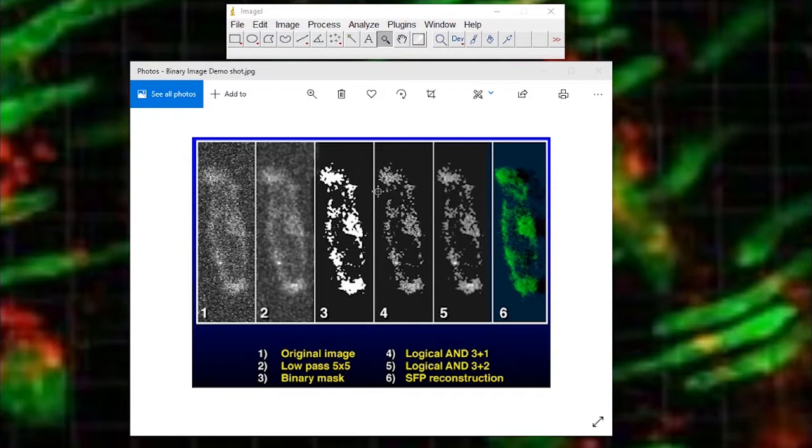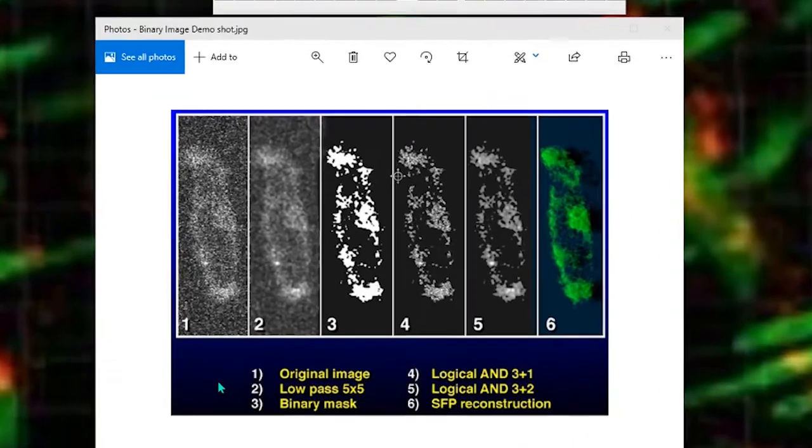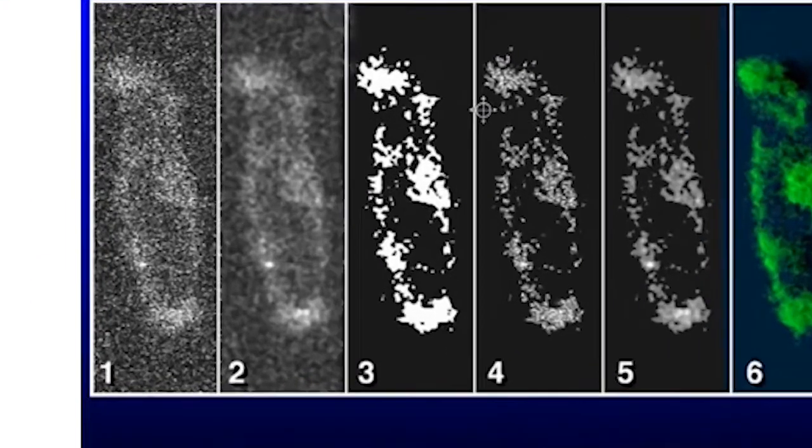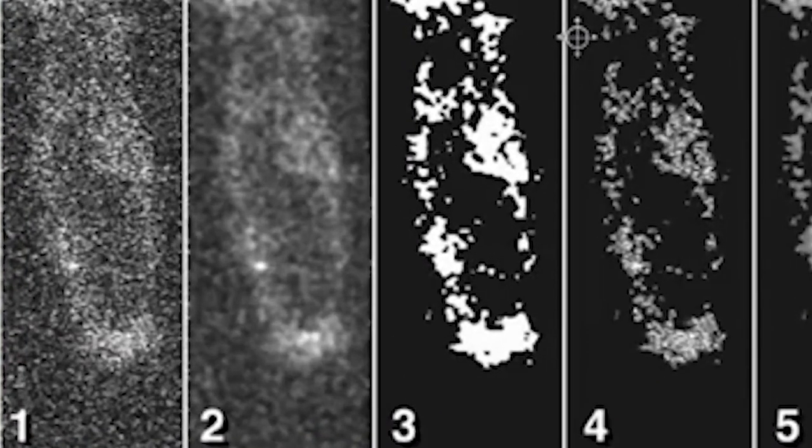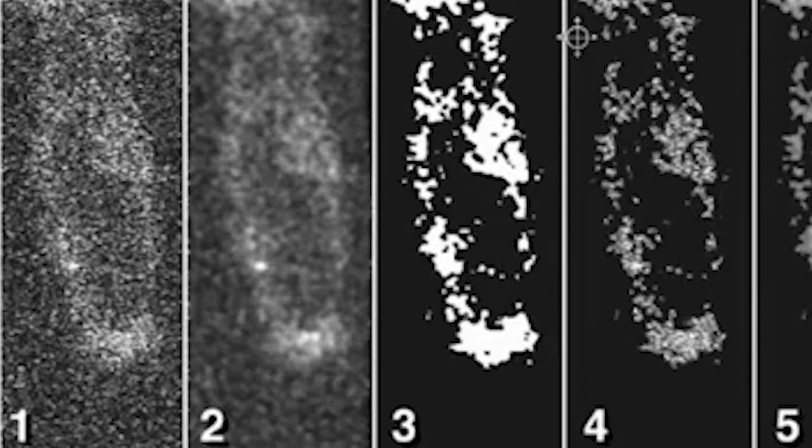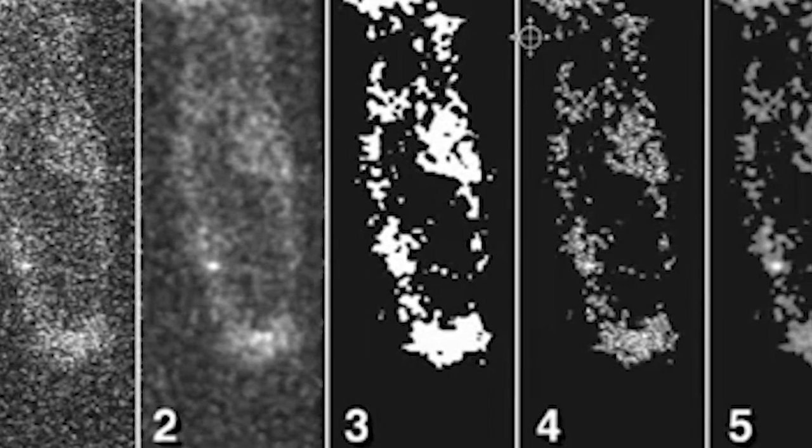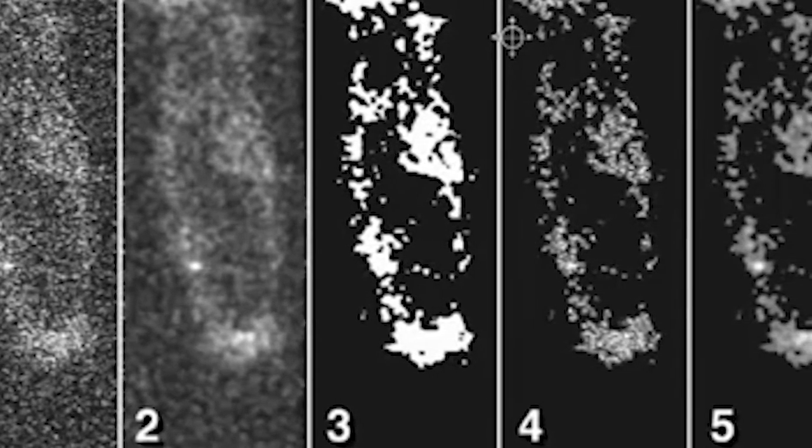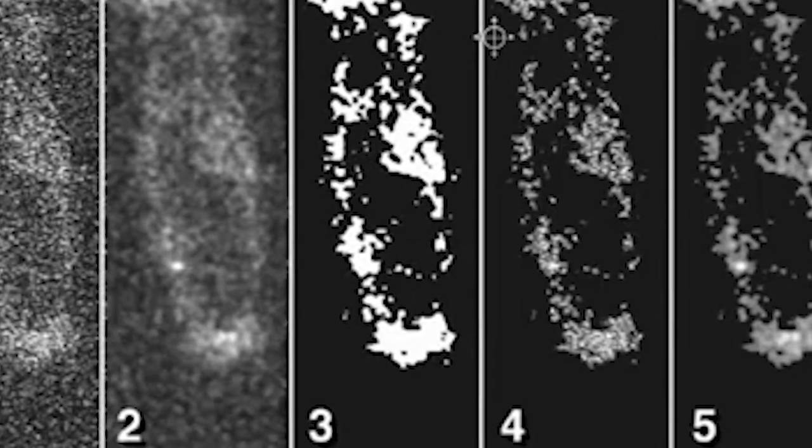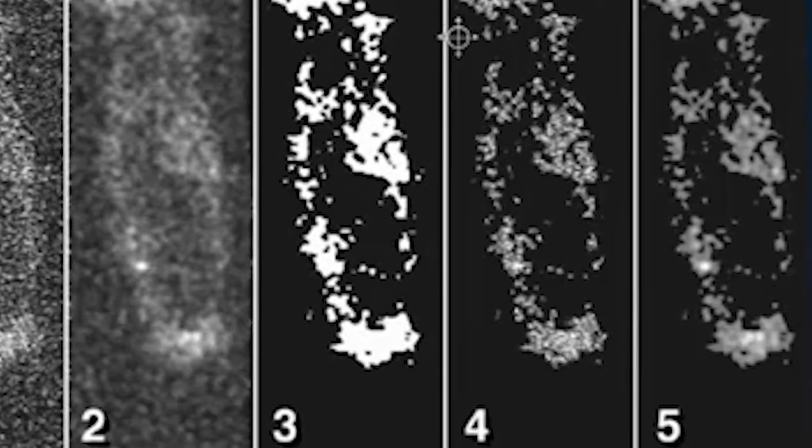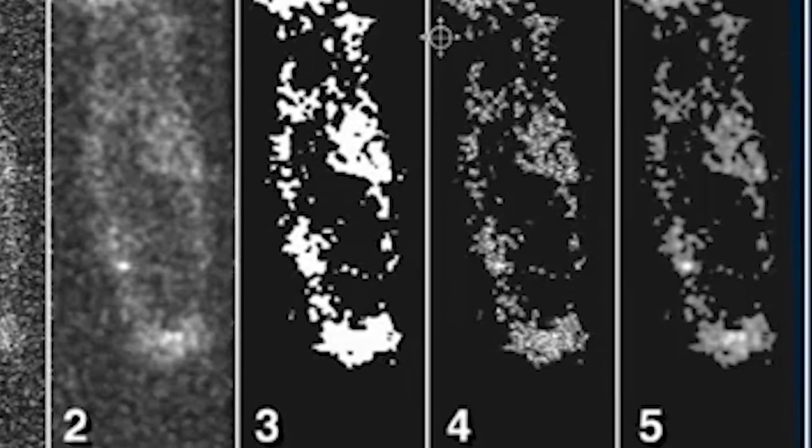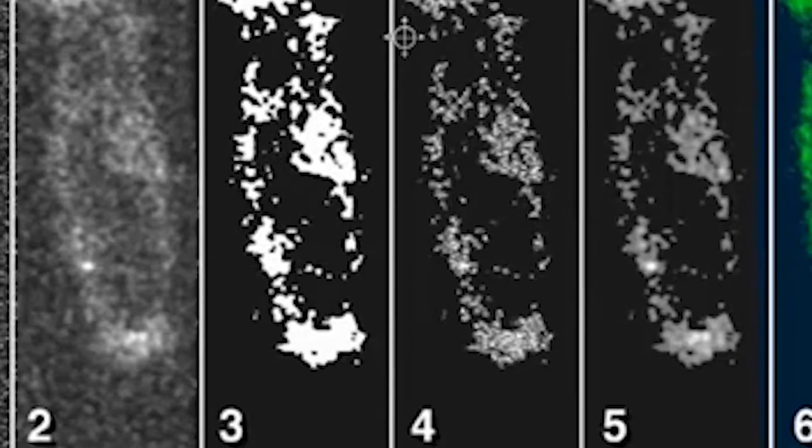The image you're looking at here is one of the first image analysis routines I was ever shown by an old friend Matt Nielsen who I worked with many years ago. You'll see in box one we have a very grainy poor quality image. It's a cell expressing some receptors, a very low concentration of the drug, so the image quality is not great but the drug concentration needs to be low in order to maintain selectivity. Long story, but we've got a noisy image.